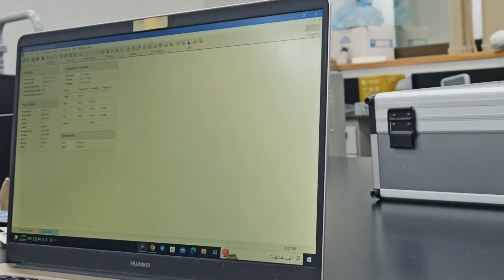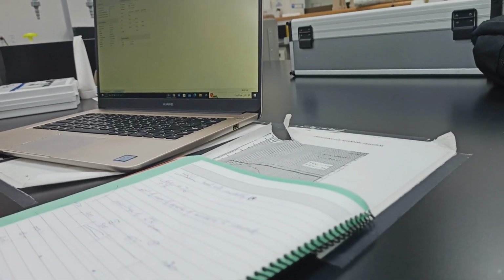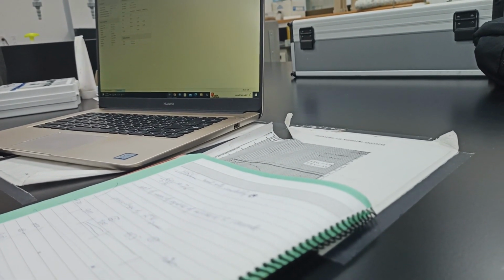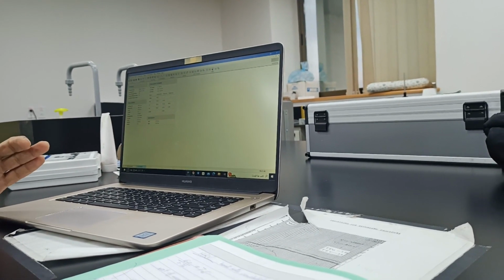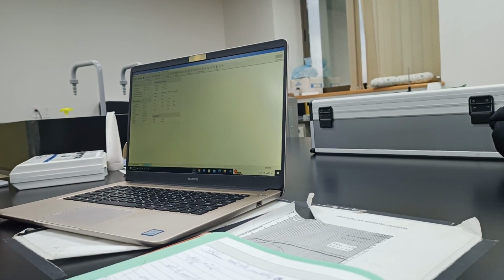So for today, this was the main lesson: how to set up your file, how to automate your data analysis, and what are the most important things to keep in mind. Now your job is to develop the template file and then analyze the two files we already have.